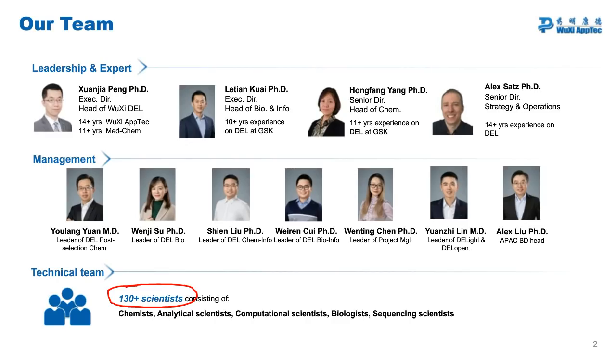How do you ensure fidelity of individual reactions in the split and pool process? Yeah, so every building block that we use is tested in a model test case before the DEL is made. In addition, while the DEL is being produced, you can test the mixtures to make sure that the reactions seem to be going well. Although that is not a concrete thing, you're dealing with mixtures at that point in time, and it is hard to measure yields in an accurate manner. Most of the QC work for making a DEL is done before the DEL is made, and that is why it is very important that the reactions you use when you make DELs work very well and are not finicky.